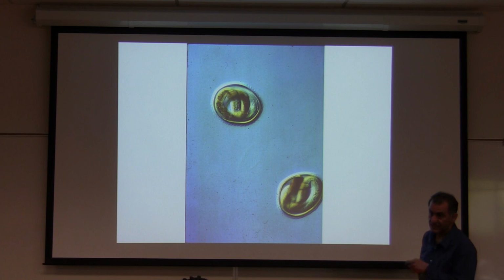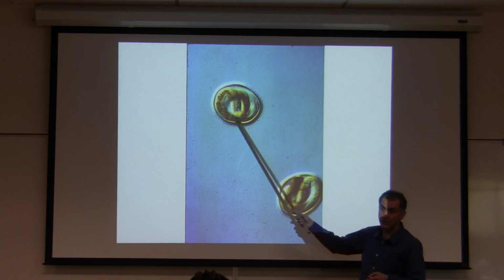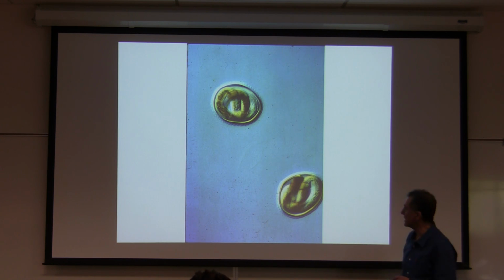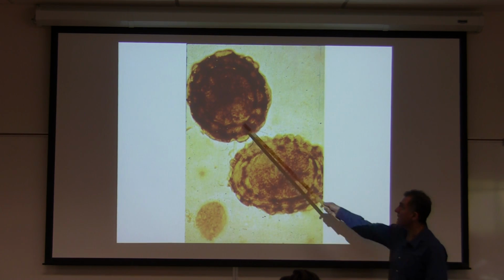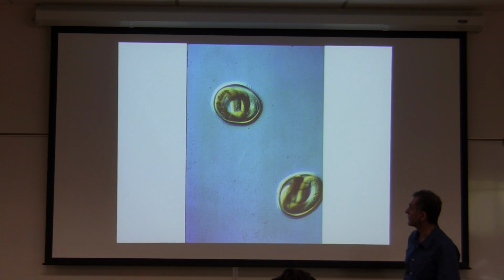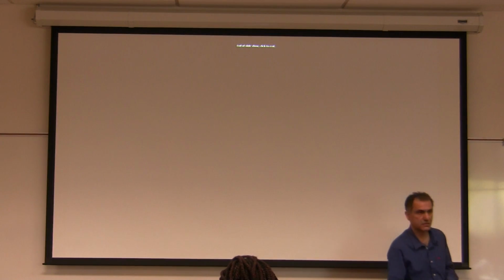What stage is that? Either L1, L2, or L3. If it is a larval stage, yes. If I ask you what stage, L1, L2, or L3, definitely, these are all right. Yes, Ancylostoma, and that was the hook.